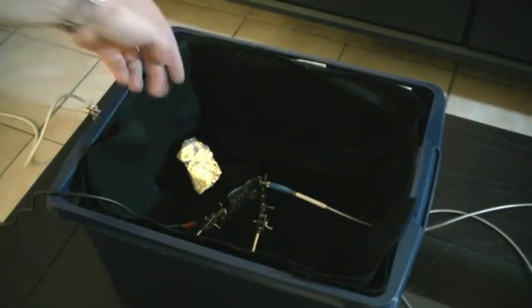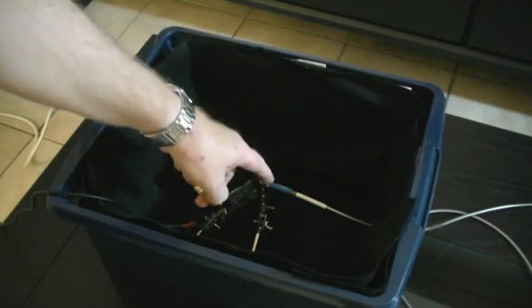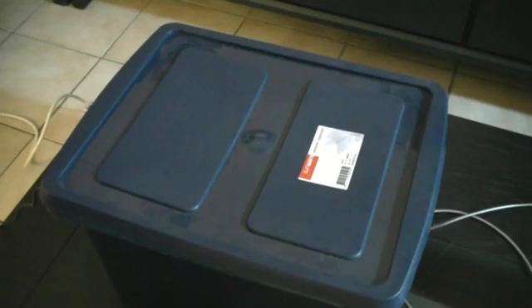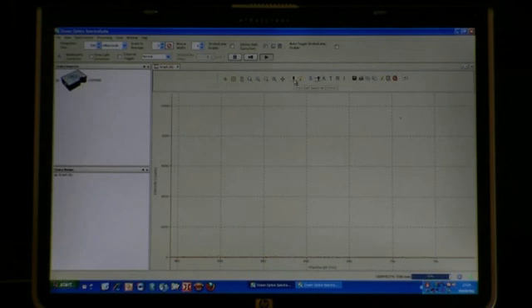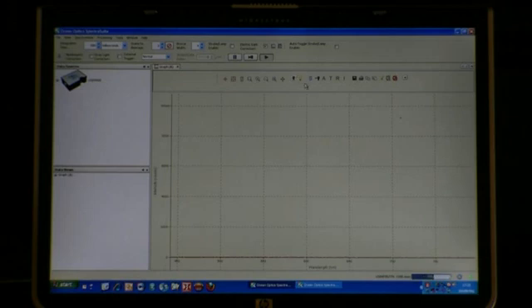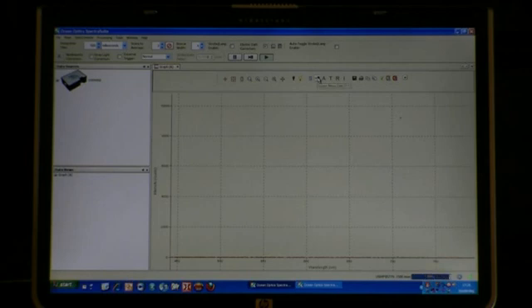I'm now going to do a setup and then we'll have a look inside. The mineral, the UV source, and the optic fiber are all installed inside our sophisticated measuring cell. I now just have to put the lid on — and we are good to measure. I'm first going to measure a dark spectrum to eliminate all errors and artifacts of the spectrometer so that we get a clean, undisturbed spectrum. I do this a few times to ensure that the curve is essentially flat, and then I push the button — scope minus dark.